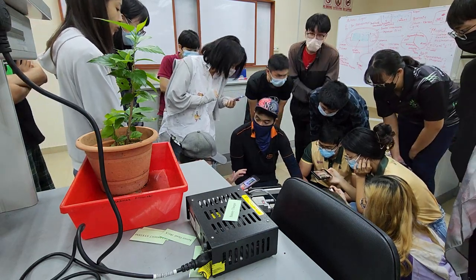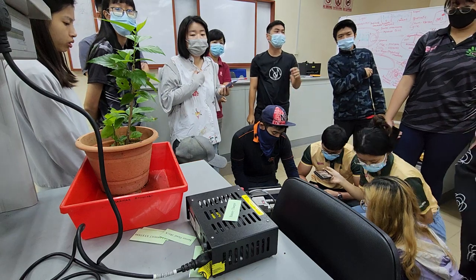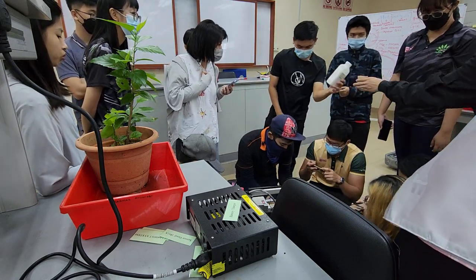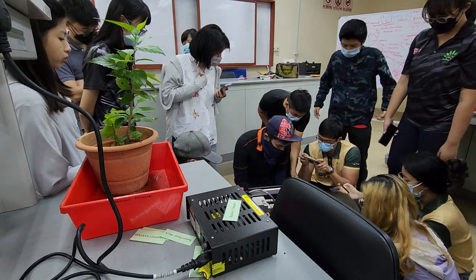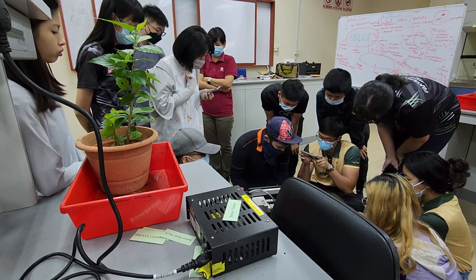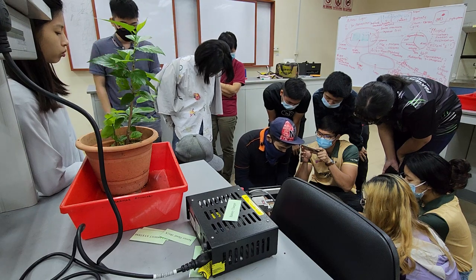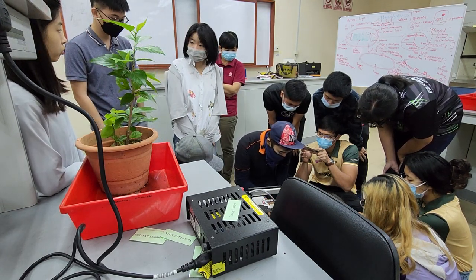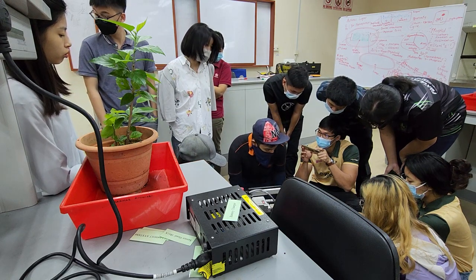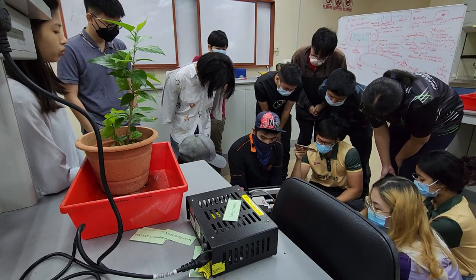Just in case, can you get a new soda lime? The white one. To increase the speed, I change the soda lime. Just do zero. We are calibrating it again. We re-zeroing. Zero high. Final adjustment. The thing is closed.